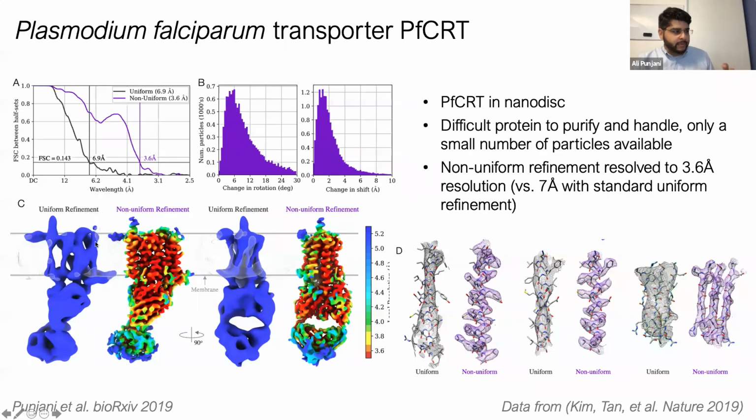And it's a small membrane protein, quite small. Like the entire membrane protein is actually fully inside of the membrane, and there's a fab bound, one fab attached to the protein, so very small.